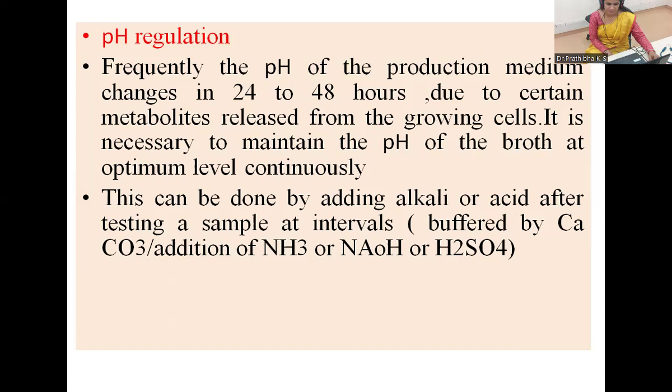In there, you can see that automatically so many changes can also be observed. Like that, even pH during the period of time will also vary. One has to adjust. It is necessary to continuously maintain the optimal pH of the broth. The optimal pH must be maintained.